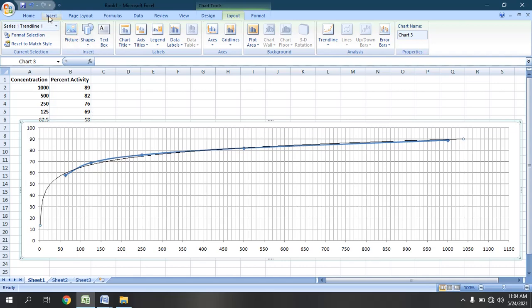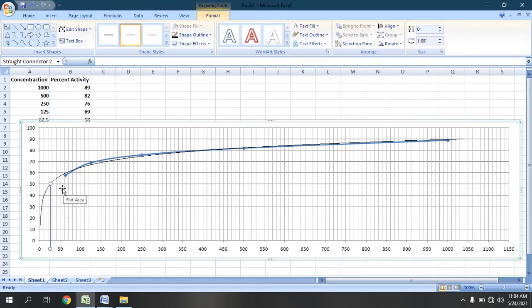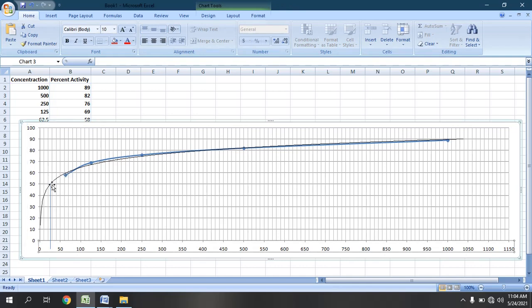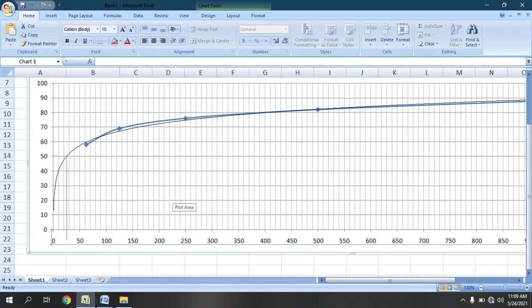To find this intersection point precisely, we will go to Insert, then Shapes, then select the linear line tool. This straight line will be drawn from the intersection point down to the x-axis. You can see this line is now straight. By zooming in, we can see that this line is intersecting the x-axis at a specific point — and this is the point where the trend line intersects the 50% activity level.